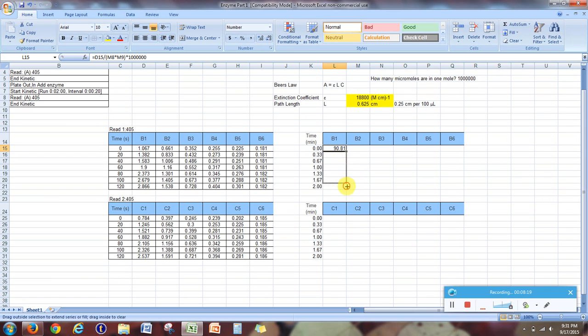Now, if I just copy and paste this, I get garbage. Why do I get garbage? Well, if you double click on the last one, you see now it's pointing at nothing in particular. It's pointing at this. We want it pointing up there. So what can we do to fix this? Now there's actually a trick in Excel. If you use the $ sign, which is shift 4, the $ sign basically tells Excel to not change the formula when you copy and paste it, to continue pointing at what you're telling it to point at. So I'm telling it to point at M8 and M9. The $ signs tell it to continue pointing at M8 and M9 despite any copy pasting I do.